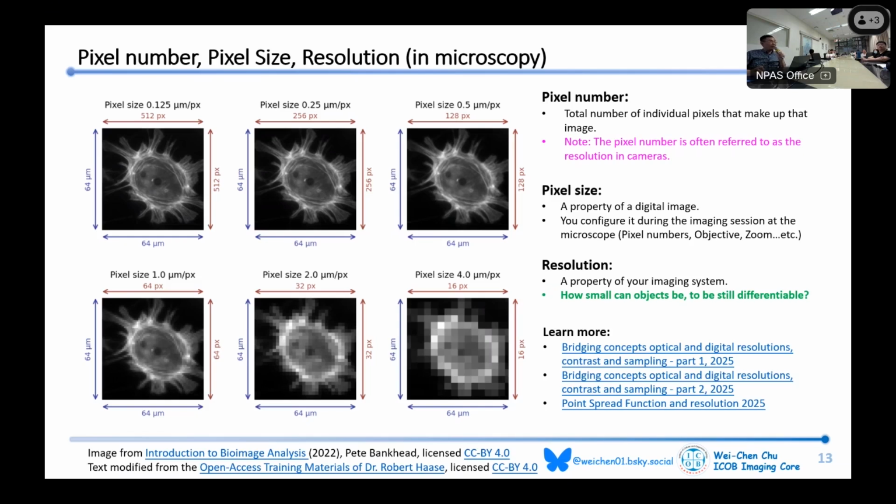What is the best sampling? I mean, the best number that matches the optical resolution. That is a big issue, and you can learn more from those online videos. It takes maybe more than 2 hours. So if you want to learn more, check those online resources.